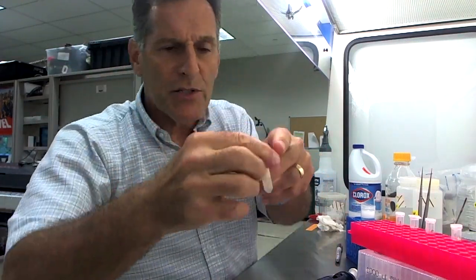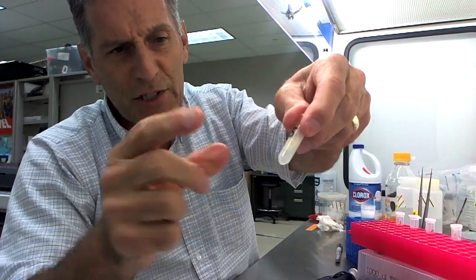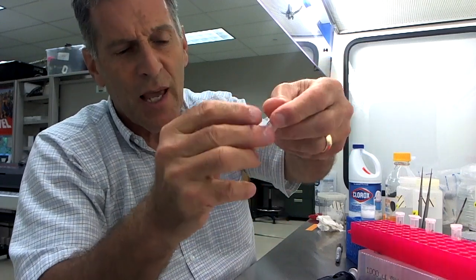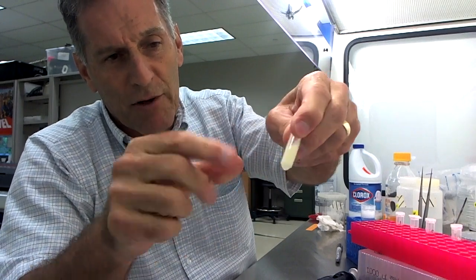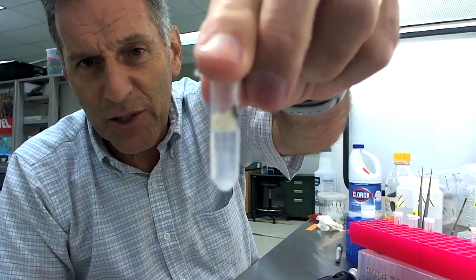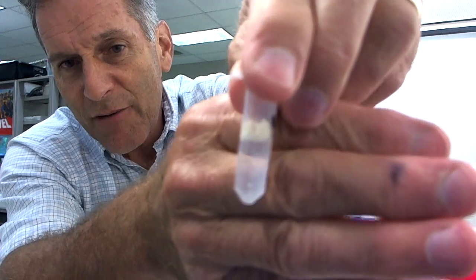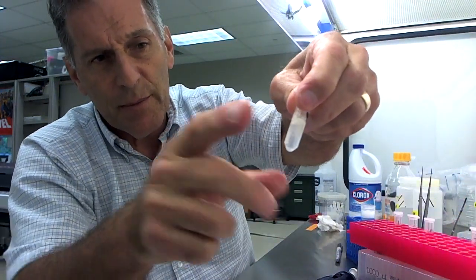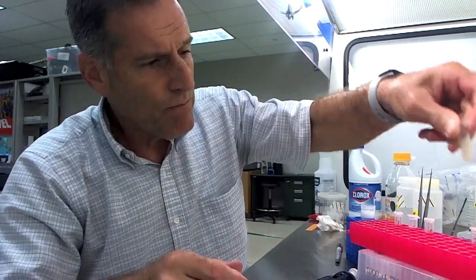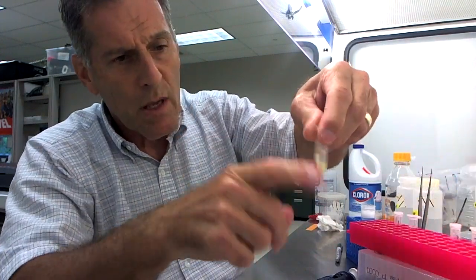The next step is to vortex these tubes. This is called finger vortexing, and it mixes them up very thoroughly. I have a hand vortexer and an automated vortexer, and I'll bring that over as well. You can see what happens is they don't mix very well until you mix things up thoroughly. I'm going to use the automated vortexer.